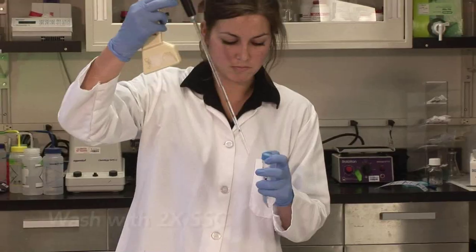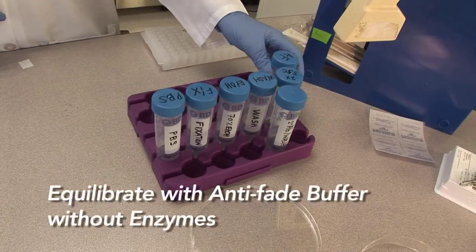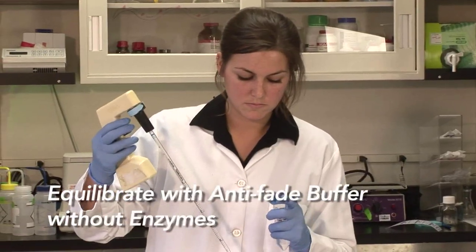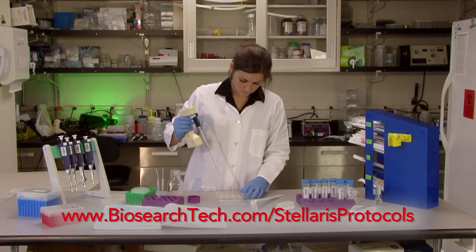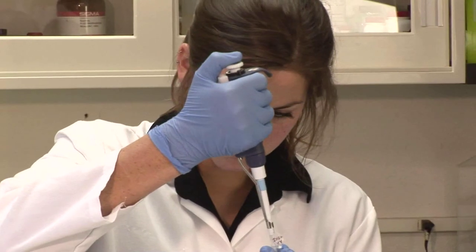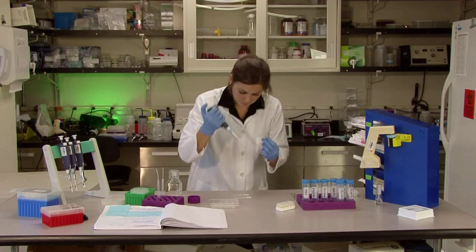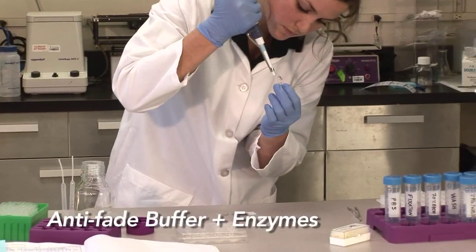After the second wash, the cells are now briefly washed in 2x SSC. The cells are now equilibrated in anti-fade buffer minus enzymes. And again, the components of the anti-fade buffer can be found on our Stellaris protocols webpage. During this equilibration period in anti-fade buffer, a single drop of anti-fade buffer plus enzymes is placed on a microscope slide.